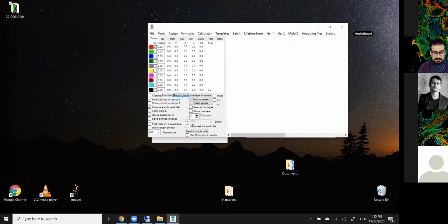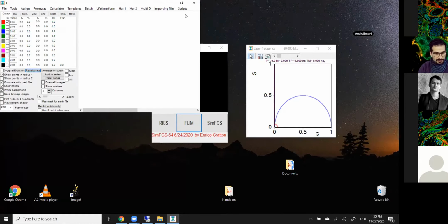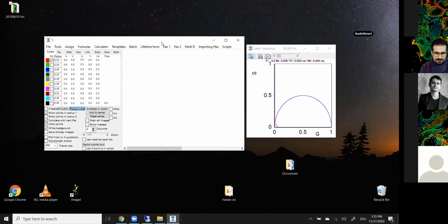When you click on the FLIM and maximize it, the first thing that comes to my mind is that it would have been nice if everything got a little bit larger. It's quite difficult to read all the information which is here.